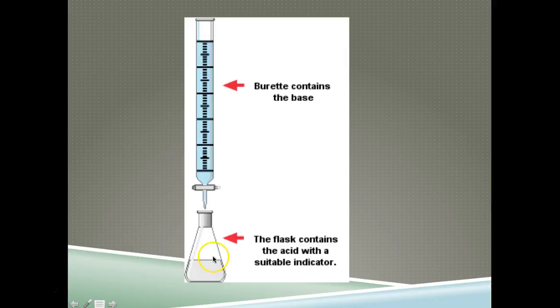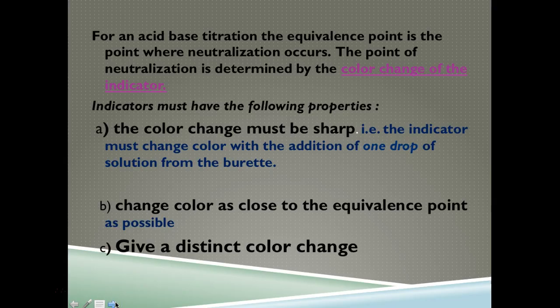In cases of HCl and any OH type of neutralization, the desired indicator is phenolphthalein. Because phenolphthalein is a dye, it's colorless in acid, but then it turns pink when it's slightly basic. So you'll be adding the base dropwise to the acid till you've reached that end point where the acid is completely neutralized, and then the indicator turns slightly pink, showing you that you've reached the end point.